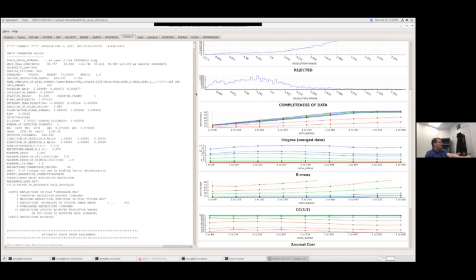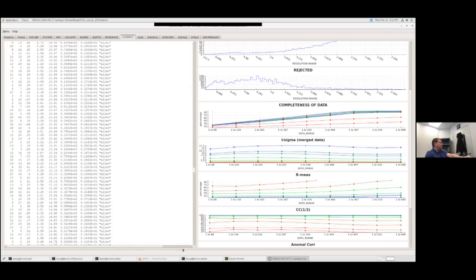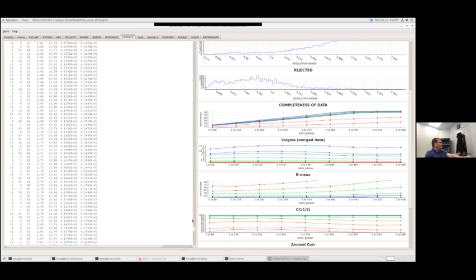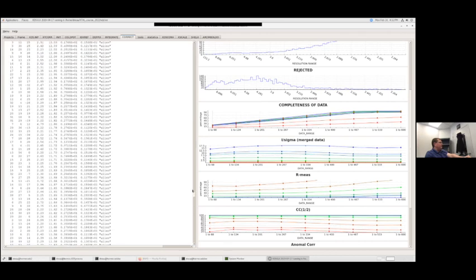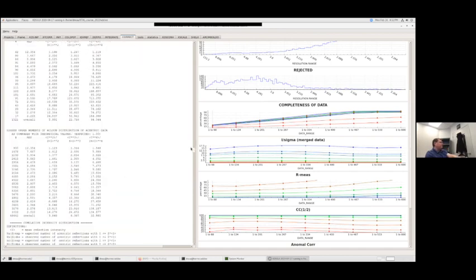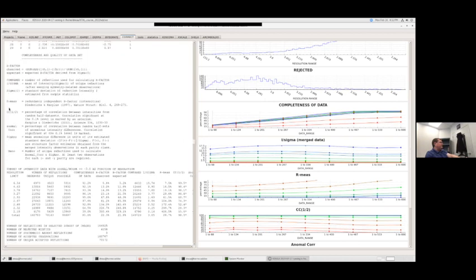And then these values are actually presented, if you scroll down. Usually the best way is to scroll all the way to your bottom and then start scrolling back up, until I find this table here. So it's going to say completeness and quality of data set, and it's going to have that. So you've got to be careful.